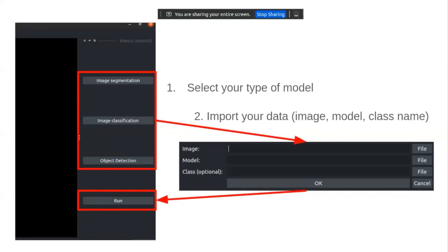The image that you provide as input can be a 2D image, 3D image, or more. That's all for the input. When you import your data, you can click OK and click Run to run the inference.